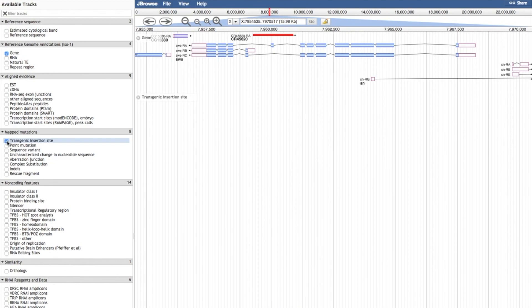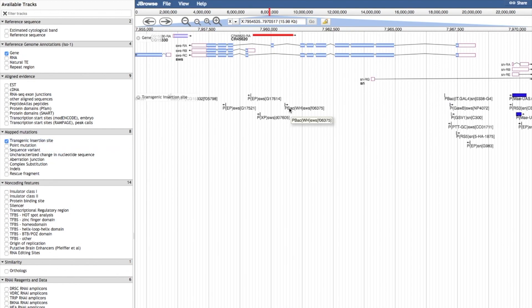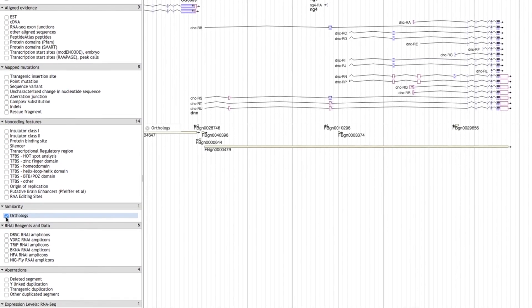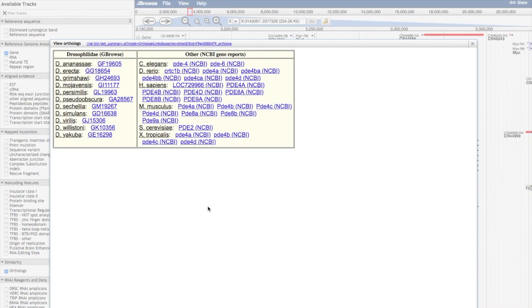In the mapped mutations section, you can view transgenic insertion sites, indicated by a vertical line, or a blue box if the estimated insertion site is larger, with an arrow indicating orientation if known. Clicking on any one of these will lead to the corresponding FlyBase insertion report. The Point Mutations track indicates locations of single nucleotide changes, which link to the corresponding FlyBase allele report. The Orthologues track adds yellow bars covering orthologous regions. Clicking on a box generates a pop-up showing Drosophila orthologues on the left and other orthologues on the right.